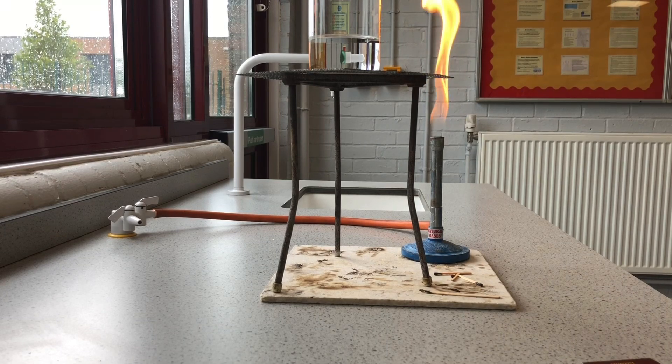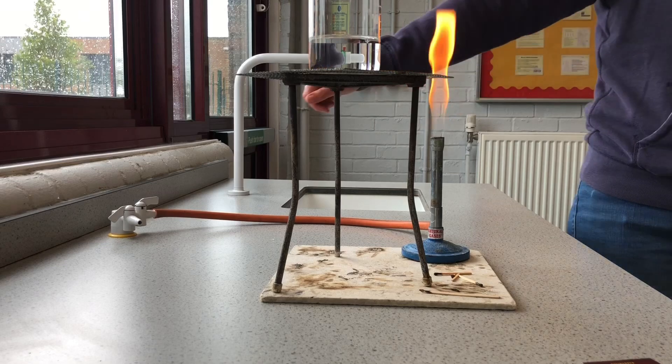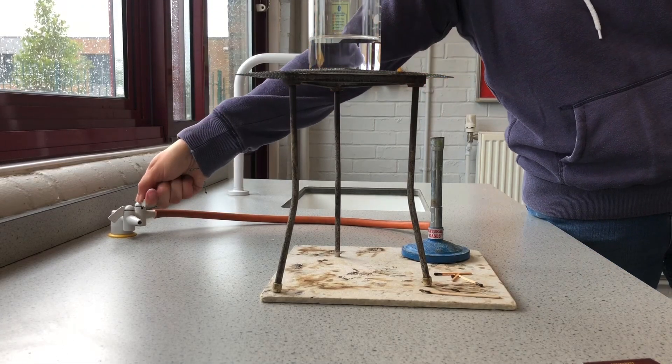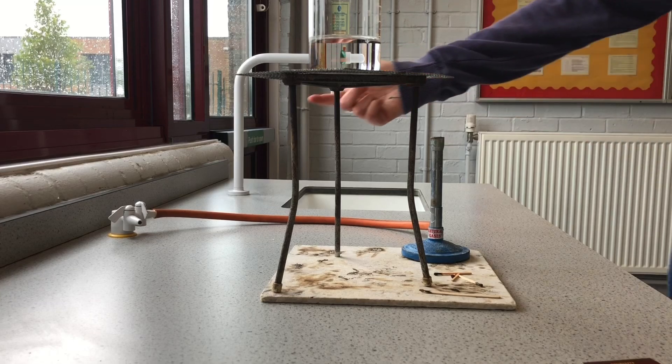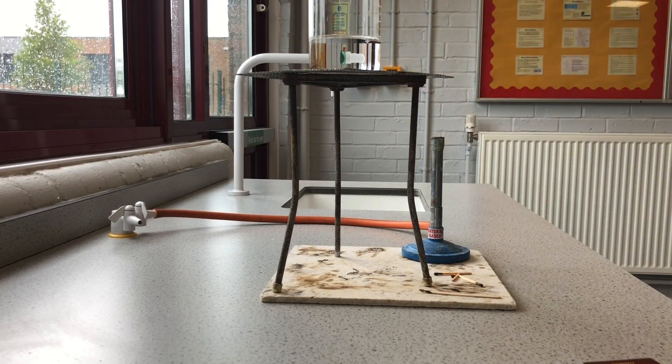When we want to turn our Bunsens off, we don't blow them out. We just do exactly what we'd do with a tap with water coming out — we lean over, not over the flame because that would be dangerous, and we just turn off the tap. So long as it lifts up and drops down, we know it's safe.